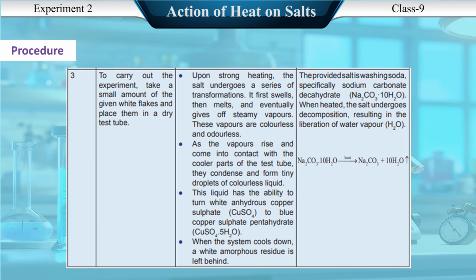This liquid has the ability to turn white anhydrous copper sulfate to blue copper sulfate pentahydrate. When the system cools down, a white amorphous residue is left behind. The provided salt is washing soda, specifically sodium carbonate decahydrate. When heated, the salt undergoes decomposition, resulting in the liberation of water vapor.